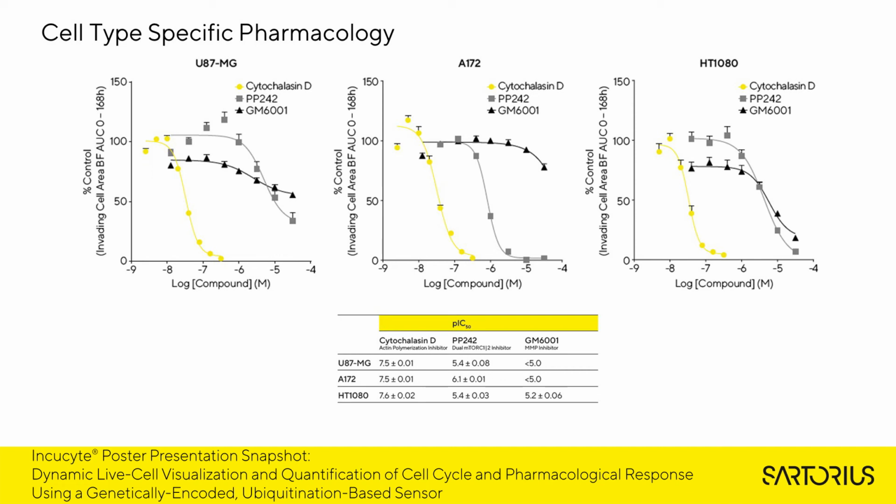Plotting cell count over time shows that treatment with PMA induces a lack of proliferation. The disruption in cell cycle after PMA treatment is also shown. By plotting the percentage of population in either the green or the red phase of the cell cycle, a clear increase in the percentage of red cells, or the G1, and a clear decrease in the green cells is shown with the PMA treatment.